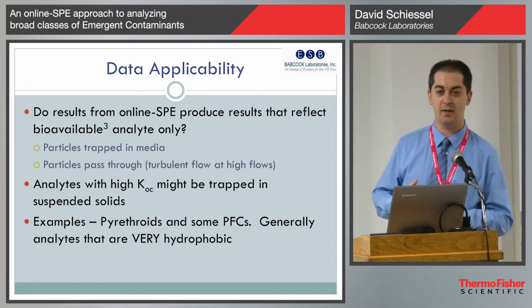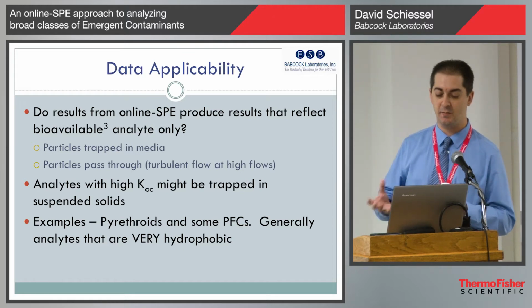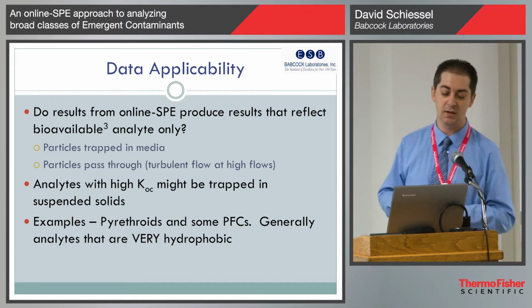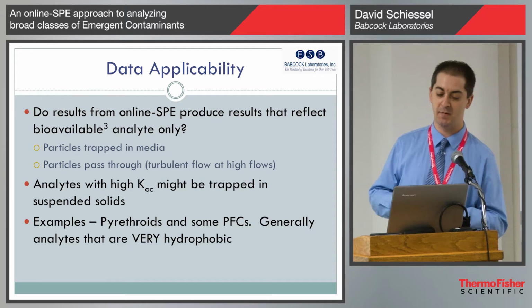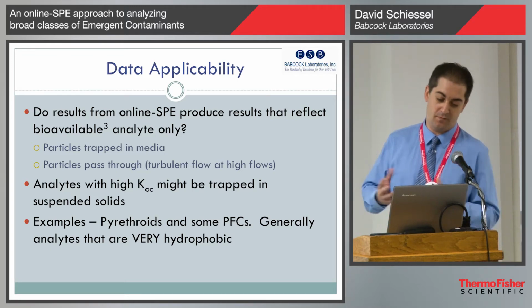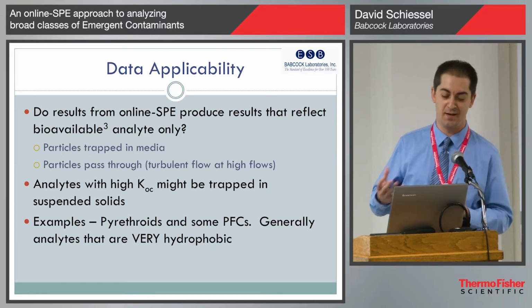This has come up with our pyrethroid method because pyrethroids are very lipophilic, and if there are suspended particles in the sample, for example stormwater with this type of matrix, whether or not we're actually measuring bioavailable contaminant has some indications on toxicity and things like that. So personally, I don't know either way, but all I can say is this is how we do it.